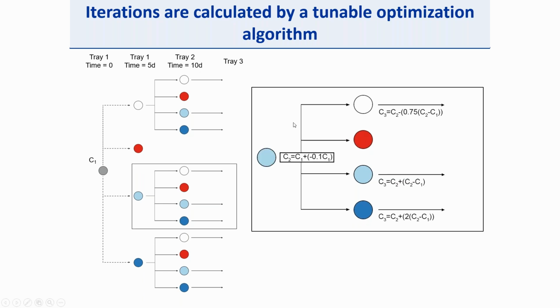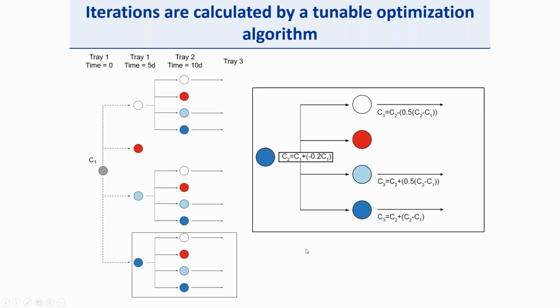Similarly, if our first score is a light precipitate, we can then drop our subsequent precipitant concentration by 10%. Or if it's scored as a heavy precipitate, you could drop it by 20%. It's worth noting that each of those specific percentage amounts can be customizable, so whatever is suitable for your own research needs. But the whole idea is the subsequent trays you'll be setting up are optimized based upon the scores of your previous trays.